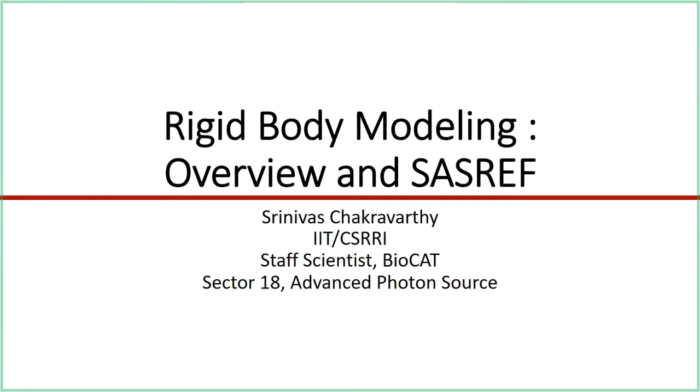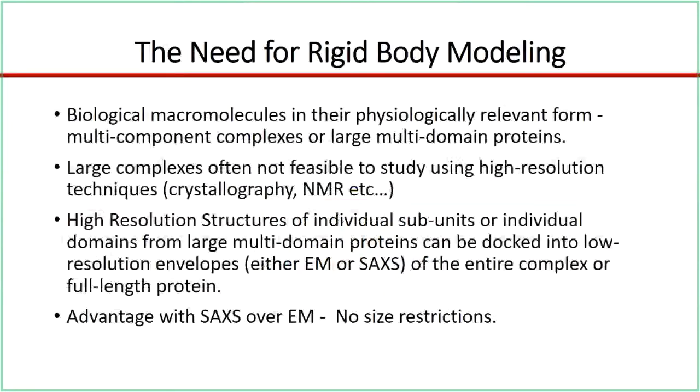Good morning, everybody. As Jesse said, I'm going to talk about rigid body modeling and probably pay a little more attention to this program called SASREF, which most, if not all of you, will at some point need to use if you're regularly using SAXS.